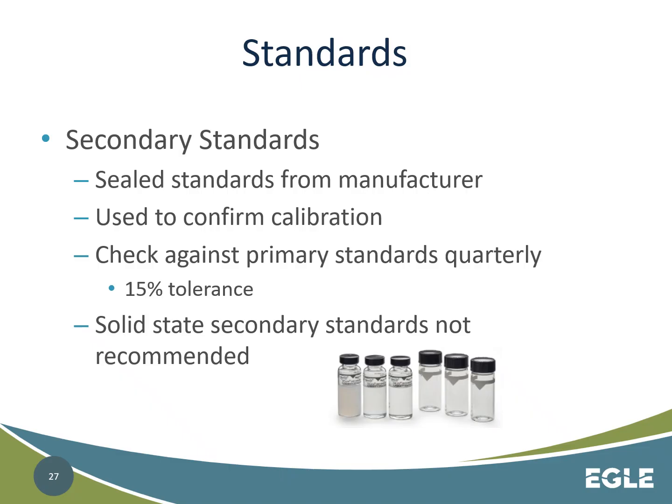So secondary calibration is required to be done at least twice a day. Most people do it when they are doing their reads. So they take a secondary standard. Depending on the machine you have, sometimes the machines have to be left on or need a 15-minute warm-up period. Some of the newer machines from Hach that are laser don't require a warm-up period. They can just turn on and they're good to go.